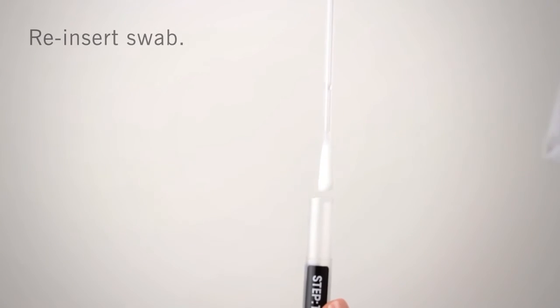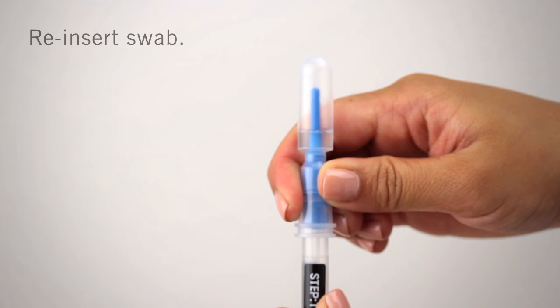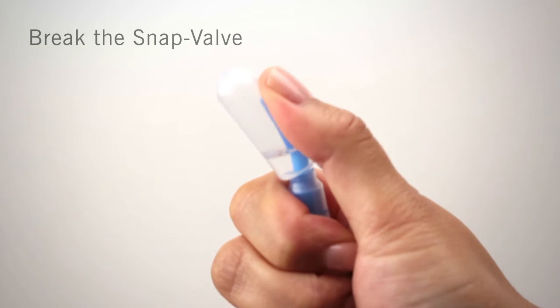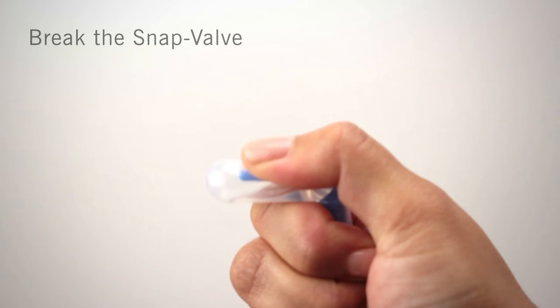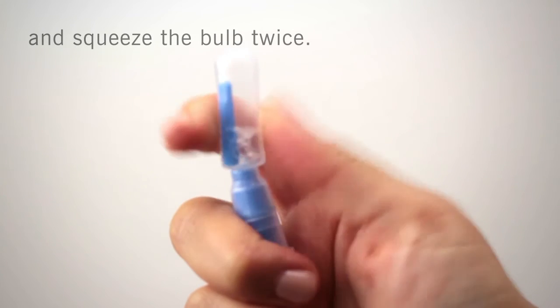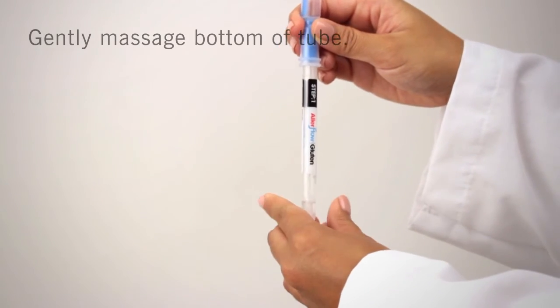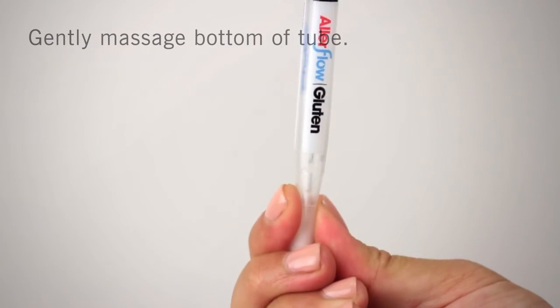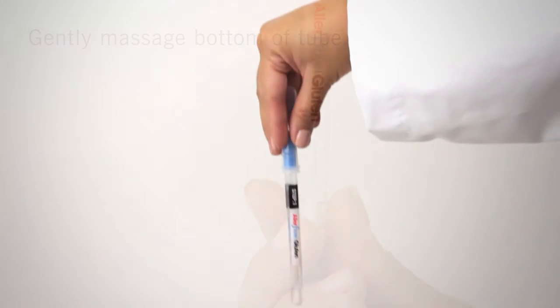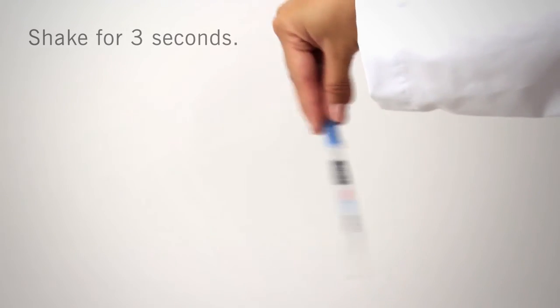Reattach the swab back onto the tube and firmly seal the device. Activate the device by holding it in your fist and using the thumb and forefinger to break the snap valve by bending the bulb forward and backward. Squeeze the bulb twice to release all liquid to the bottom of the swab tube. Gently massage the bottom of the tube by squeezing two times, then gently shake for three seconds. This will help release the sample from the swab bud and mix the sample in the liquid.